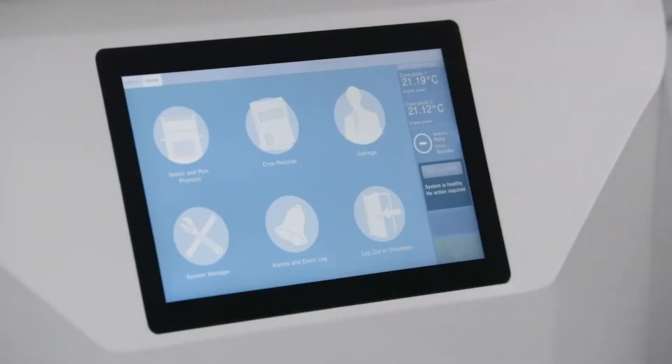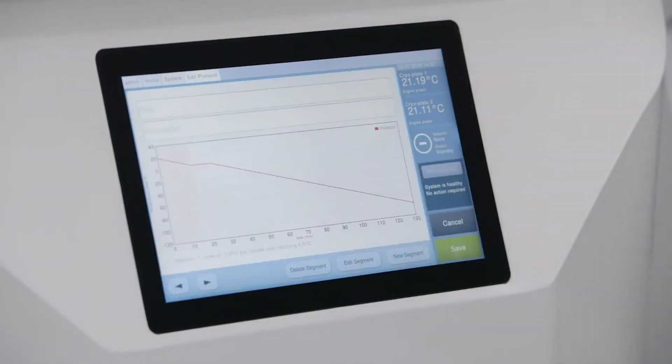From the home menu by selecting the system manager button, you can either create a new protocol or edit an existing protocol. If you start creating a new protocol, the page allows entering the title and description and shows the protocol segments. You can add a new segment, delete or edit an existing one. When done, make sure you click save.